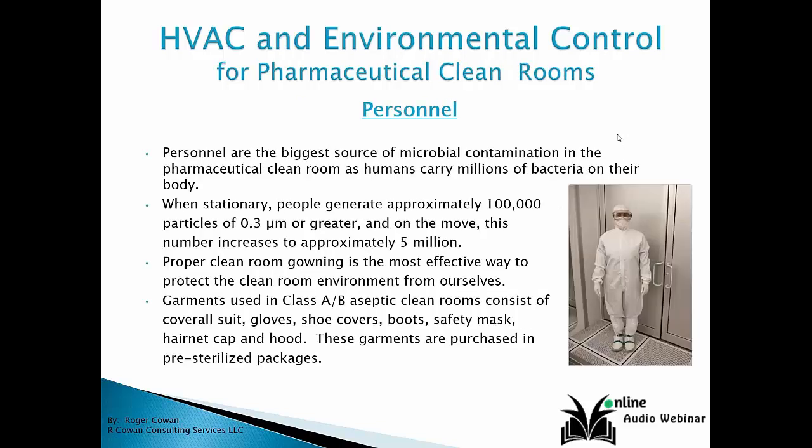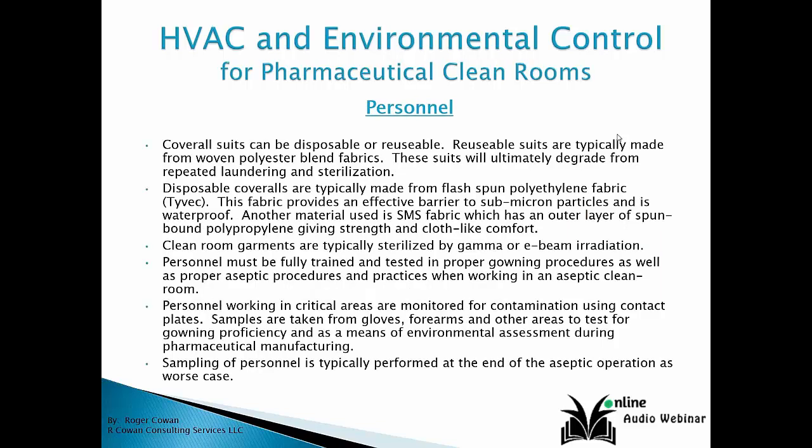Now, a quick note about personnel here. Personnel are the biggest source of microbial contamination in the clean room. Humans carry millions of bacteria on their body. These coverall suits can be either disposable or reusable. Now, typically the reusable suits that are available are made with woven polyester blend fabrics.